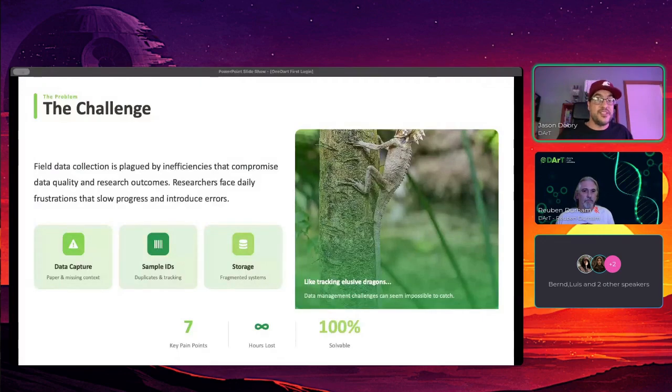And then fast forward to my PhD in 2018, where I knew I wanted to be as digital as possible, but there was still no clear solution. So I began using a series of apps that I used to collect the data, but these were spread out and led to other series of problems, such as maybe missing metadata or lack of unique sample IDs, inconsistent data entry, different spellings of things and that kind of thing.